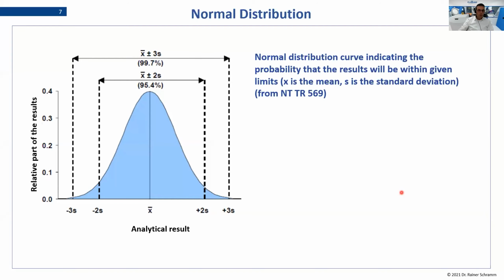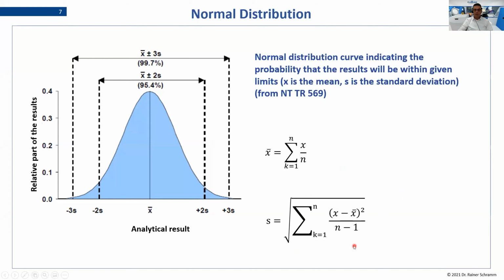And so we can use then this mathematical base to calculate the mean value with such a formula, and of course the standard deviation of the distribution. However, you have to be careful that you use the estimation of the standard deviation so that you have the n-1 here in the formula. I also put you the Excel functions.